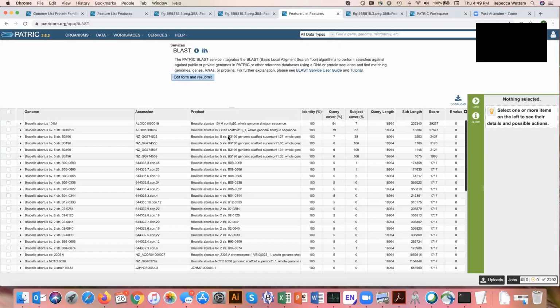And then we start, oh look, we're getting the same genome here. This BioVar 5 strain 3196. So it's still getting 100%, but then it's smaller pieces of the query. These are actually not so great. It's 7%, 6%, 6%, 6%. And actually, these are tiny little contigs. So they're very small. So it's just hitting little pieces of this contig.